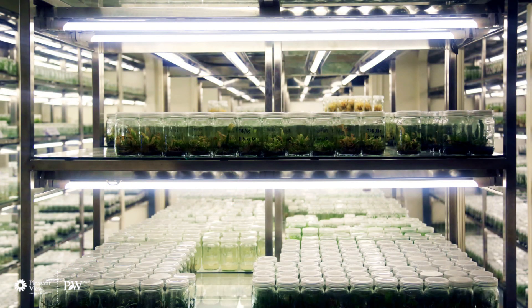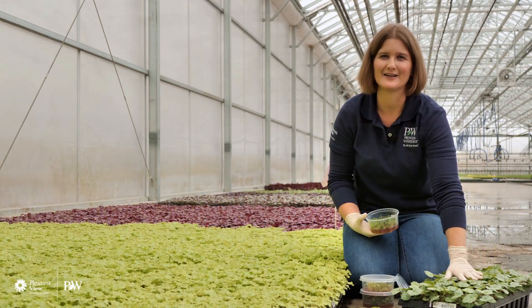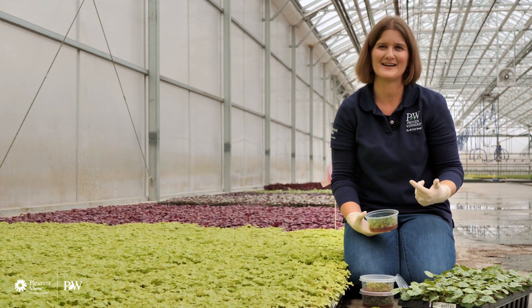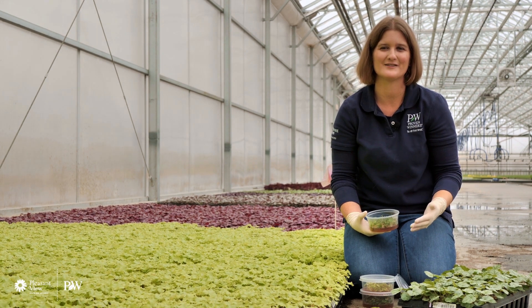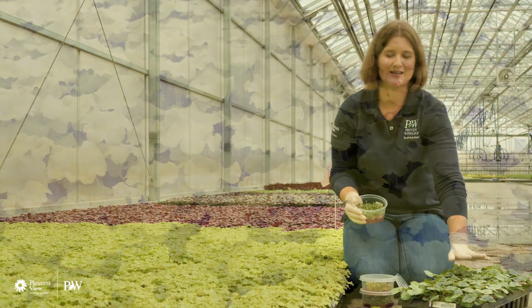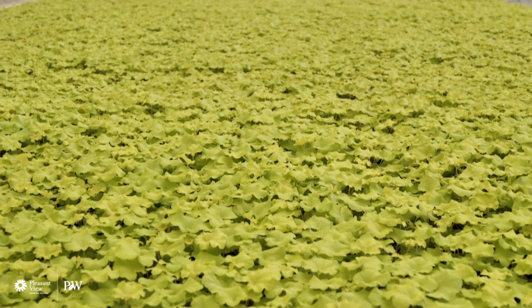Under a sterile environment and a hood, they go through and separate out the shoots and put them onto another growing media that has hormones for rooting. So stage three is rooting in the lab — these arrive to us as stage three plantlets. Stage four is acclimating them out in the greenhouse, where we provide the right humidity, the right temperatures, and the right light levels to get them from a lab situation with no sun into a plant that's ready to go out into the greenhouse and then into the garden.